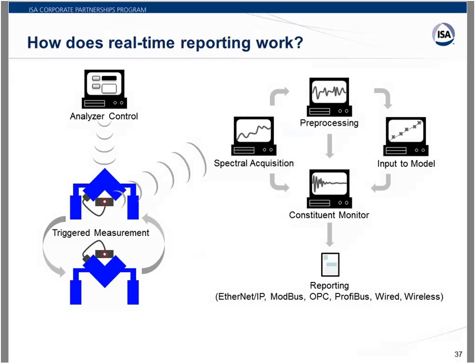Our portable spectrometer can be mounted on the V-shaped blender with its spectrometer probe inserted into it after customization. Prior to mounting the spectrometer to the blender, like the one shown in this slide, the spectral data for known standards is acquired initially in order to build a model by selecting the moisture peaks using the Chemometrics software. Once the model is built, it can be transferred to the portable spectrometer in order to monitor the moisture content in the sample in real time while the blender is still under operation.